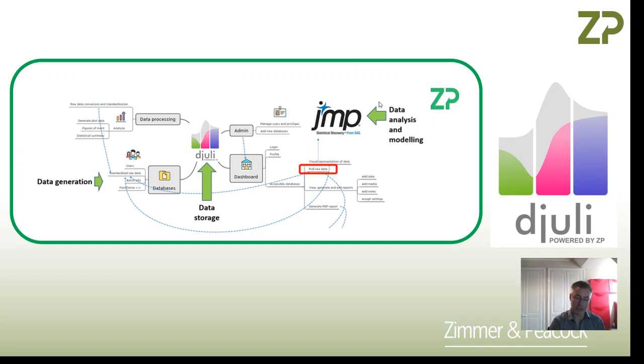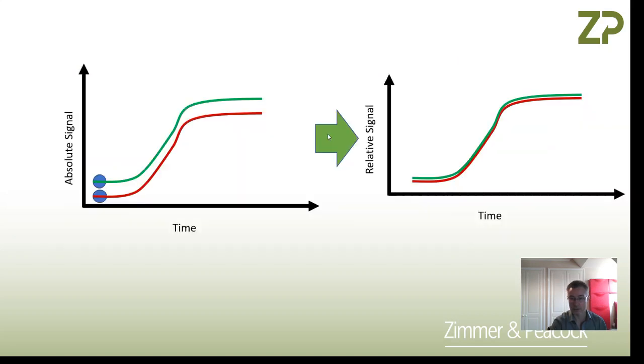So I just want to comment that Excel really won't cut it. Excel is an accounting tool. It's a cool bit of software, and it's quite ubiquitous, but Excel really won't cut it. If you want a decent algorithm, let's say for extracting signal from your features, then you need to be more sophisticated in your analysis.